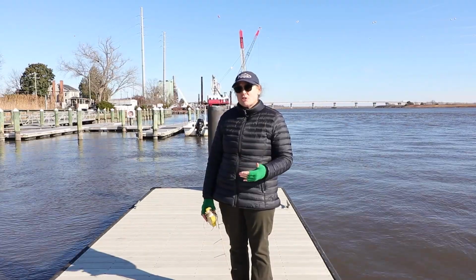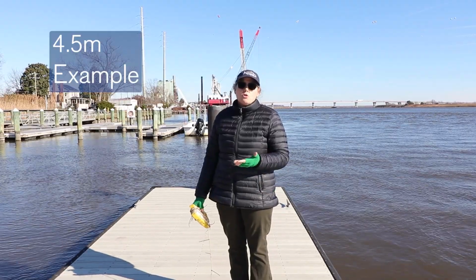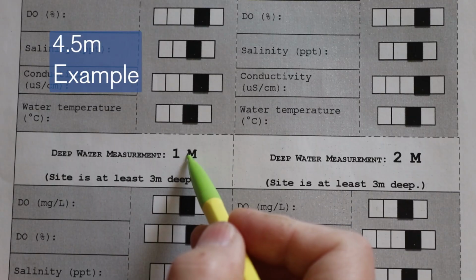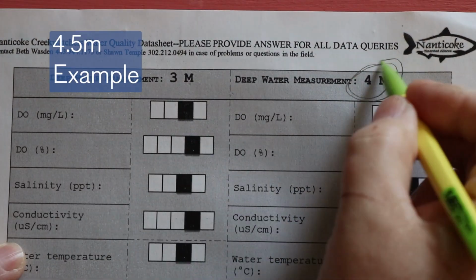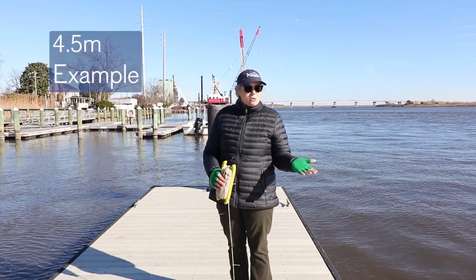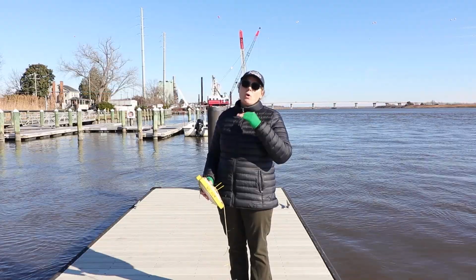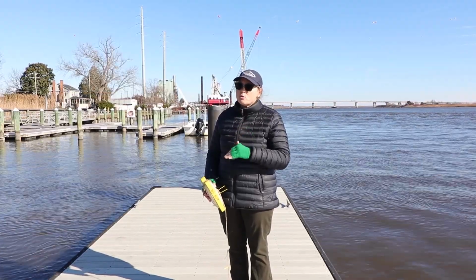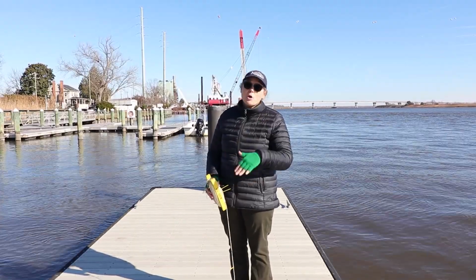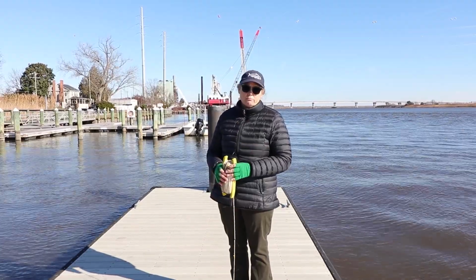Lastly, if you're at a deep water site and you have a measurement of, say, 4.5 meters, your bottom measurement is going to be at 3.5 meters deep, but you're also going to take a measurement at 4 meters deep. And this seems a little bit odd because the bottom measurement is not as deep as the 4 meter deep measurement, but we want to make sure that we're taking measurements at those 1 meter increments, as long as we know the probe is not going to hit the bottom, and the probe is still going to be 1/2 meter above the bottom, so we don't have an issue there.